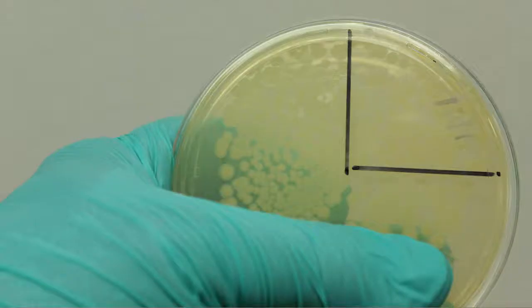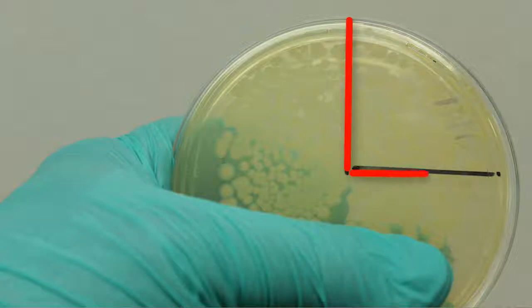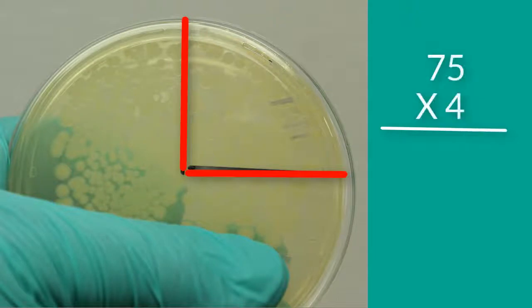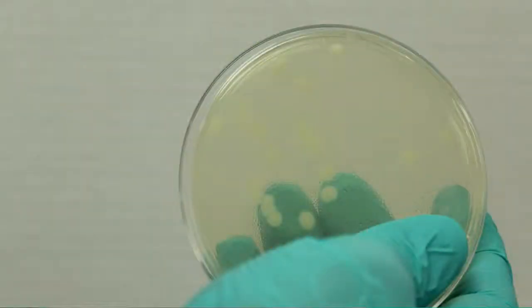Okay guys, so let's look at the results. On day 2, in order to help count the colonies, you may have to do something like this. Notice how many colonies are on this plate. So I've divided the plate into 1/4 of a section. I'll count the number of colonies inside here. At this point, I've determined it to be 75 colonies. I'll multiply that number by 4 and come up with 300 colonies for my plate count. This plate count is also viable, and I'll explain why in just a moment.